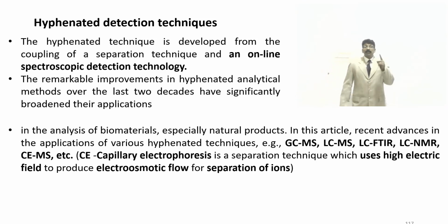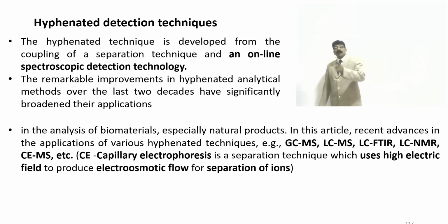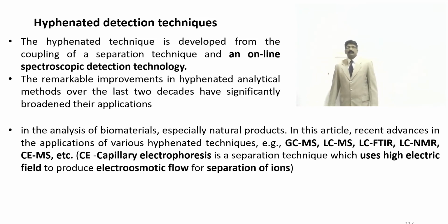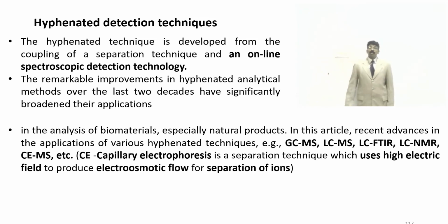Capillary electrophoresis is a separation technique which uses a high electric field to produce electro-osmotic flow for separation of ions. So CE is also connected with mass spectroscopy.